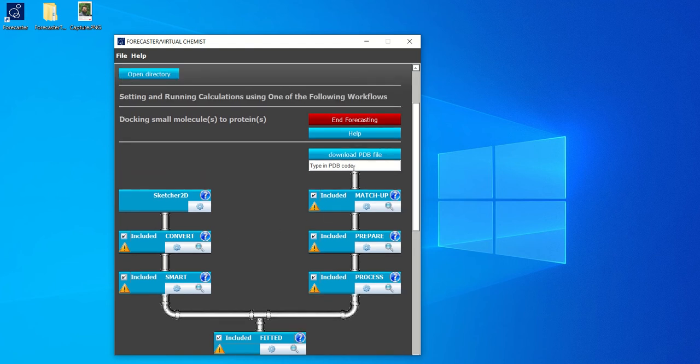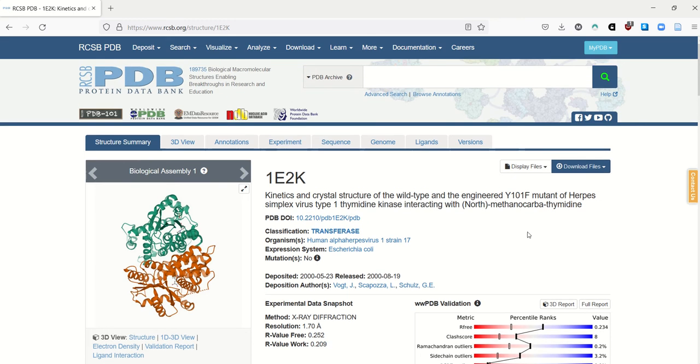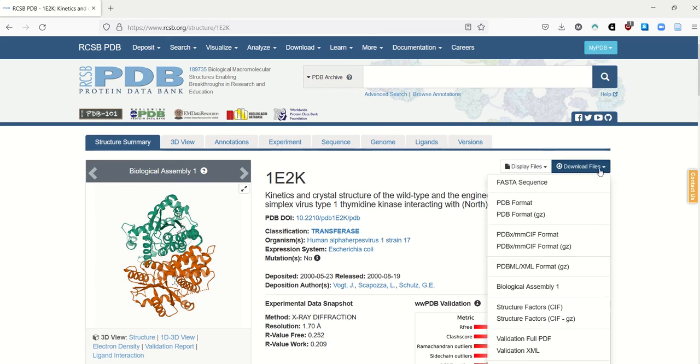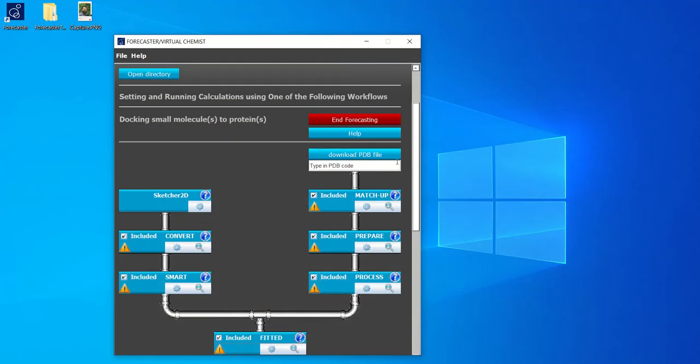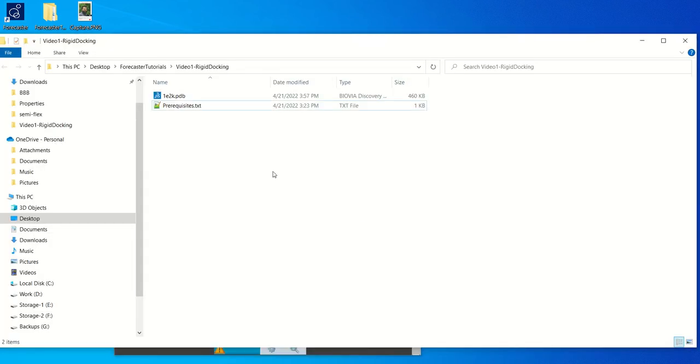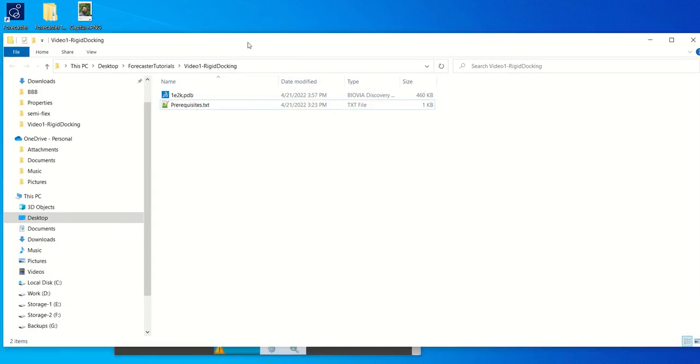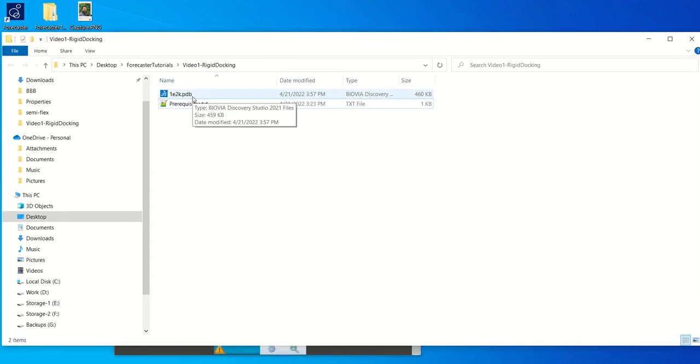The protein that we will work with today is the thymidine kinase of the herpes simplex virus. Its PDB code is 1e2k. You can directly download it from the PDB in the PDB format and save it into your working directory. Or you can write the PDB code here and then click on download PDB file. Once it's done, you will see that the PDB file has been saved in your folder.